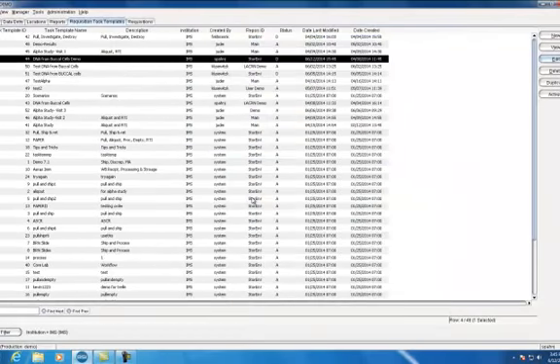I have saved and closed the template, but before it is available to users in requisitions, I must make it active. Pressing the Active button will update the status to active. Now let's see how a requisition with this template behaves.